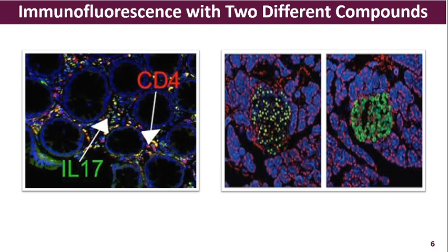So in this way, fluorescent probes conjugated to antibodies can be used for identifying antigens at the cellular level in tissue preparations. Specific antigens expressed by some cancers can also be detected by this immunofluorescent technique. Bacterial antigens of different species of bacteria can also be identified by the differential technique.